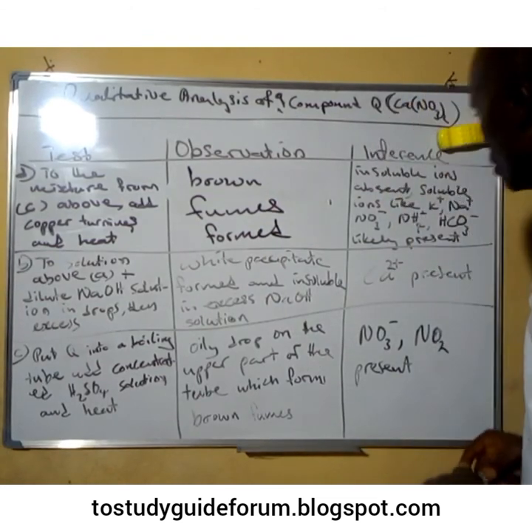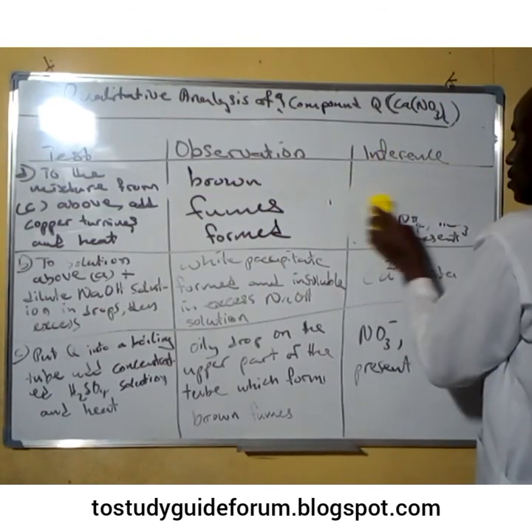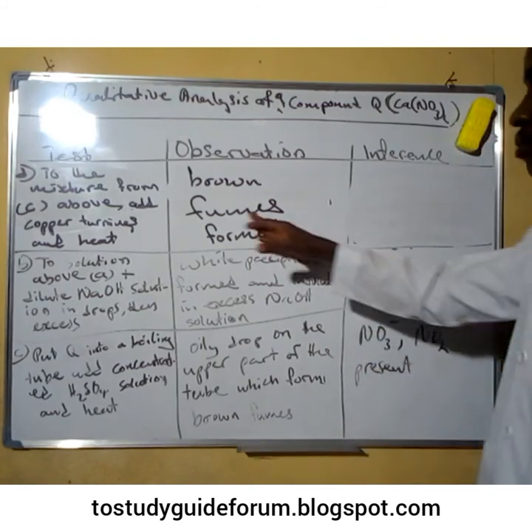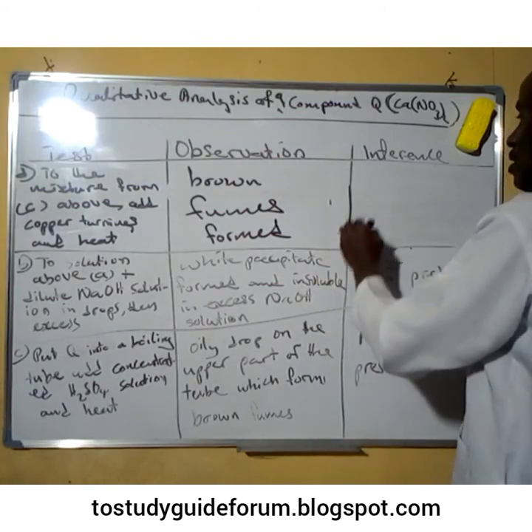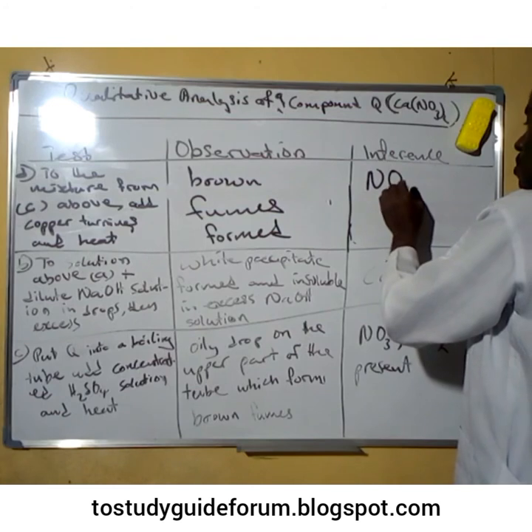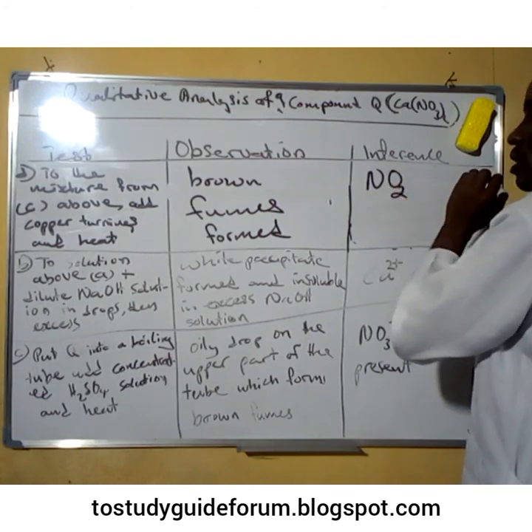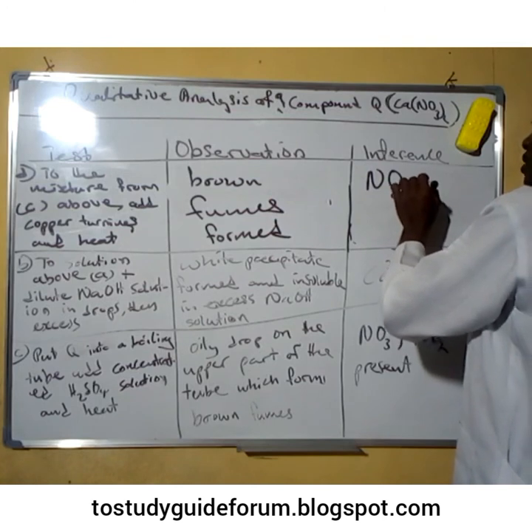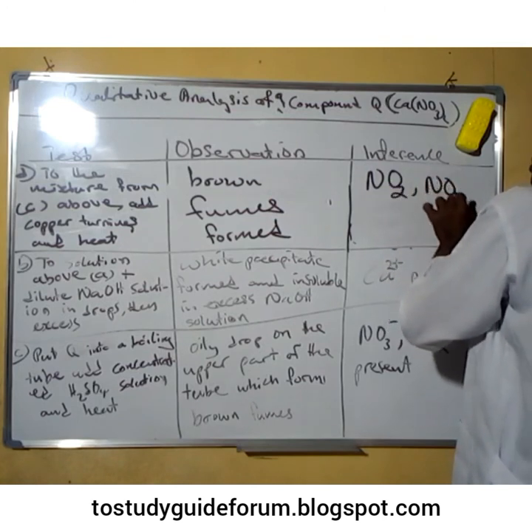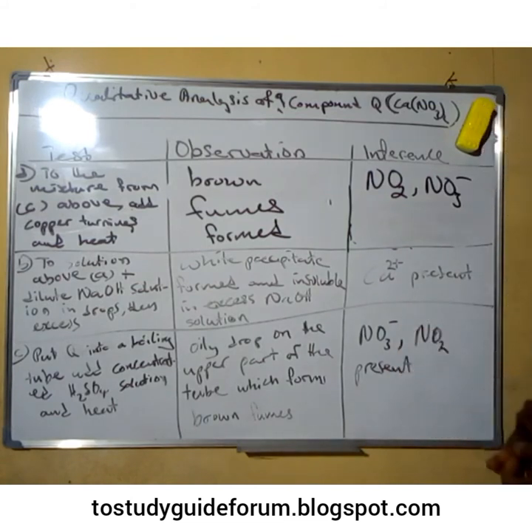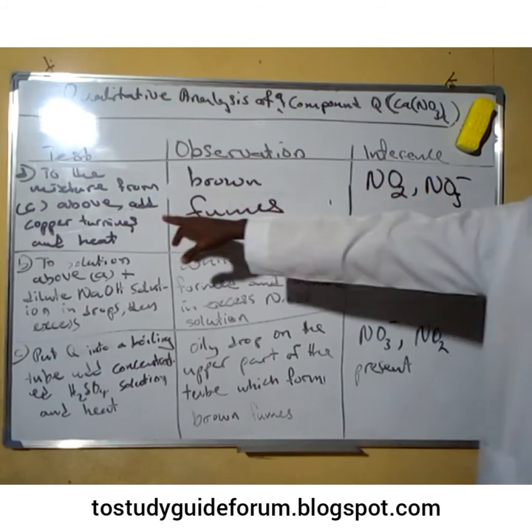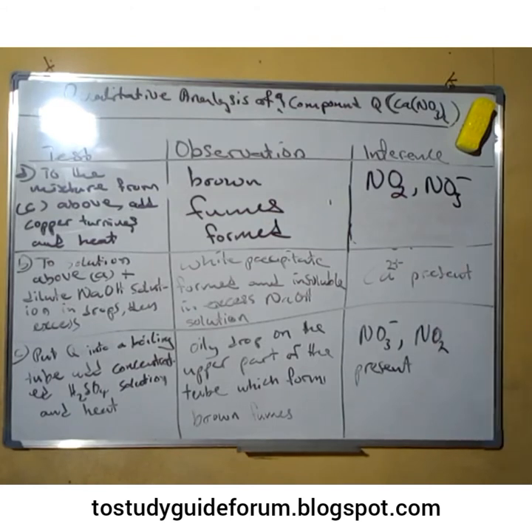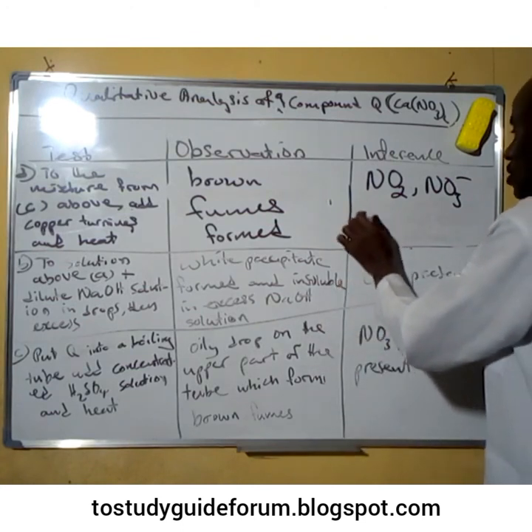In our observation, brown fumes are formed. This means that since we have the brown fume — which is now more pronounced — the brown fume is evidence that we have nitrogen dioxide (NO₂) gas. This means the compound contains nitrate; nitrogen dioxide gas is being released, and the ion present is confirmed as trioxonitrate(V).